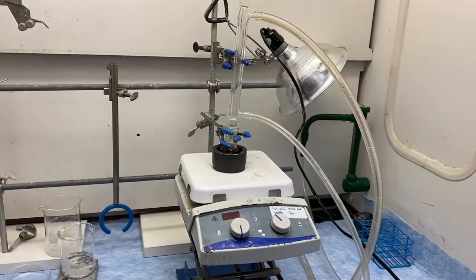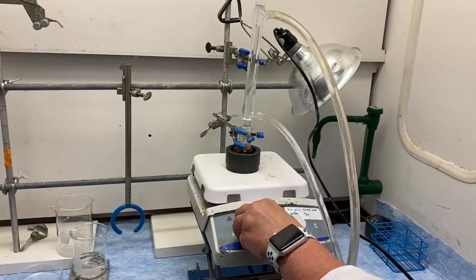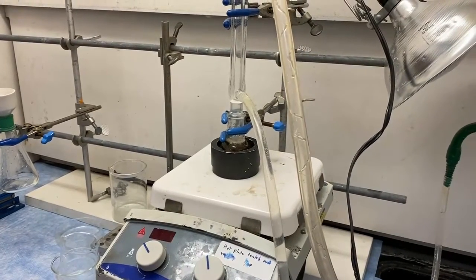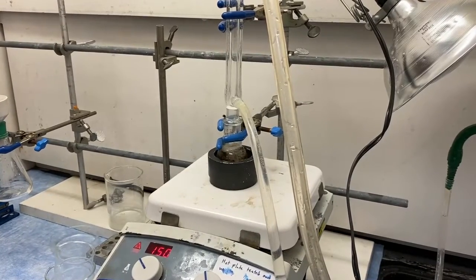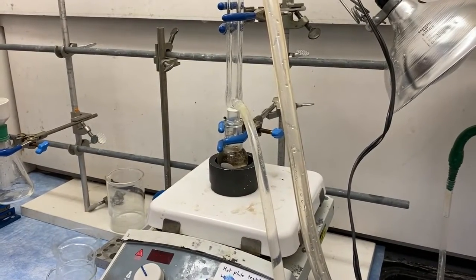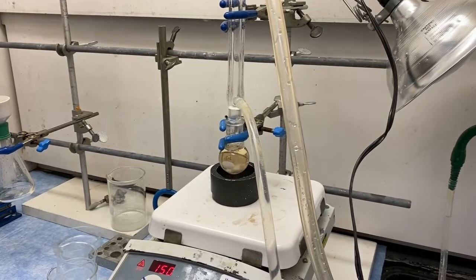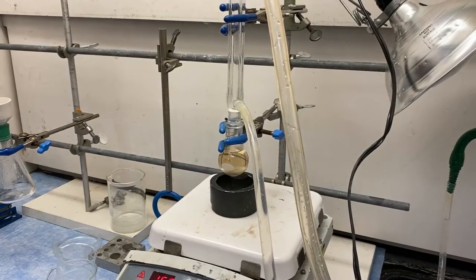Okay, turn on the water and turn on the heat. Okay, so now the refluxing for 10 minutes has completed. I'm gonna go ahead and drop the heat. I'm gonna allow my round bottom flask to cool before I start to touch it. And then we're going to put it into the ice cold water and do the filtration.